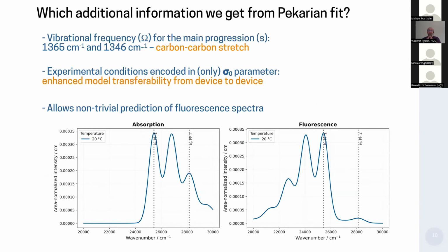As I said, the distances between vibronic peaks correspond to the vibrational frequencies active in these spectra. And these differences indeed correspond to carbon-carbon stretch. So by looking at the electronic spectrum, or UV, which is supposed to be purely electronic, we actually define 2 vibrational frequencies. This may be useful for data retrieval and for further investigations of the infrared spectra.